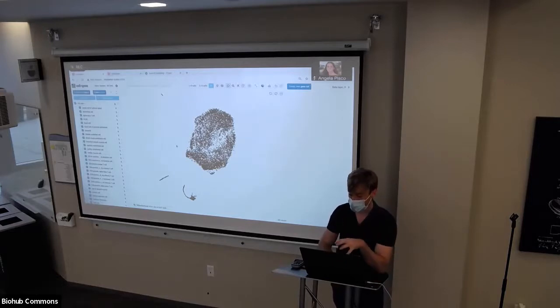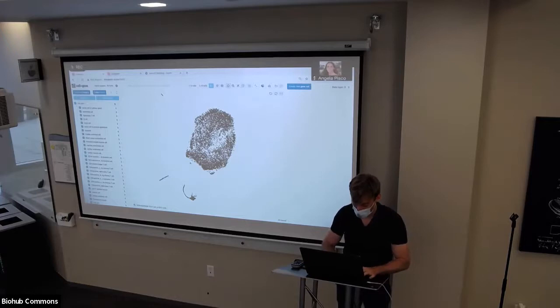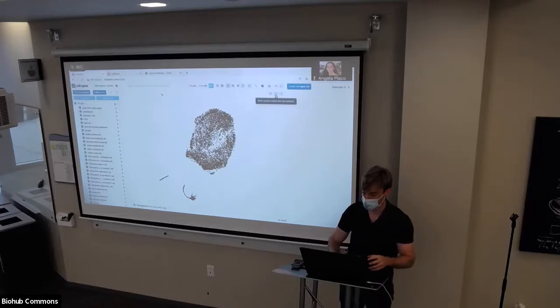But if you try doing differential expression, the backend has 480,000 cells. Differential expression won't use all those cells, it'll do the subsetting, but subsetting is a costly operation for such a large data set. So there's a button here that should be on the same row as this save thing, but I messed up the CSS. It's a button with the two arrows spinning. For other people with more zoomed out views, it might be on the top row at the left, but it just got shuttled down.